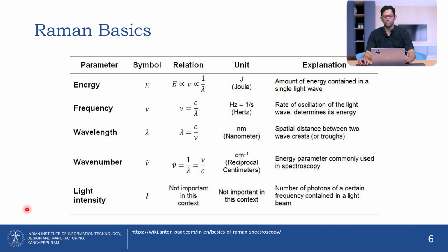Before we dive deeper into Raman spectroscopy, we need to understand a few of the terminologies which are used in Raman spectroscopy. You already know about energy, frequency, wavelength. Something new that you will hear is the wave number.